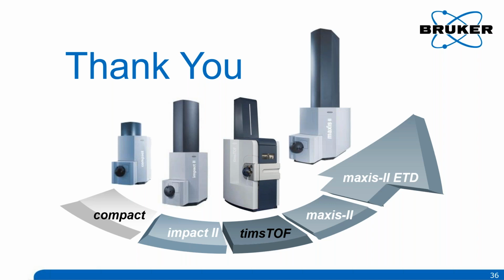So switching between the ESI and MALDI source really doesn't take any time. You don't need to reconfigure anything. You don't need to plug or unplug anything. The switch happens through a click of a button in the software. And actually, two ion sources can even be run concurrently. So for instance, you can run an imaging experiment with MALDI and use an ESI with direct injection for lock mass calibration or something of that sort. Some people even experiment with tricky ion chemistry inside the source, but that's more esoteric.